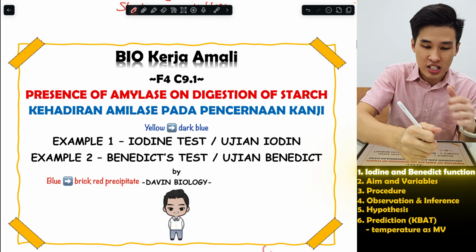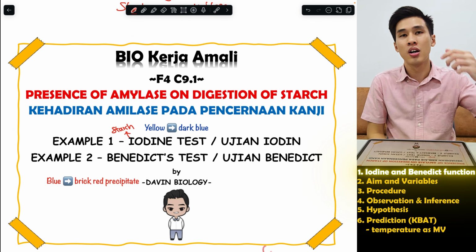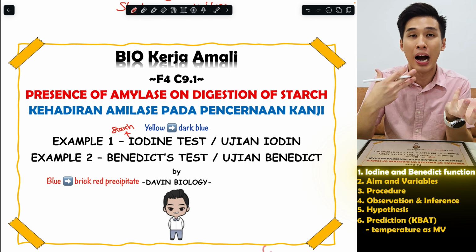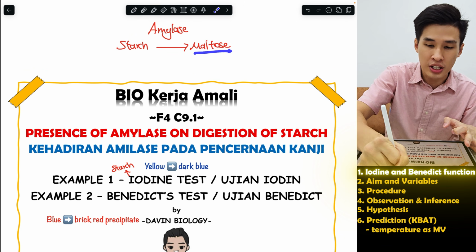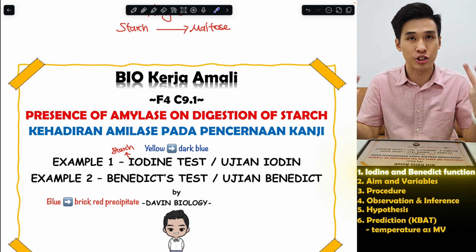Iodine is to test the presence of starch. So when there is starch, your iodine will turn from yellow to dark blue. Let's say your starch has been digested into maltose already, your iodine will not turn dark blue because there's no more starch.